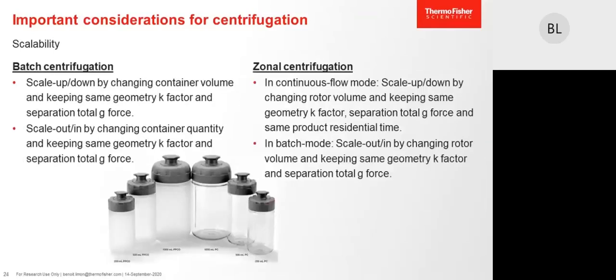So the scalability with the centrifugation works rather with the scale out and scale in, rather than the scale up and scale down.